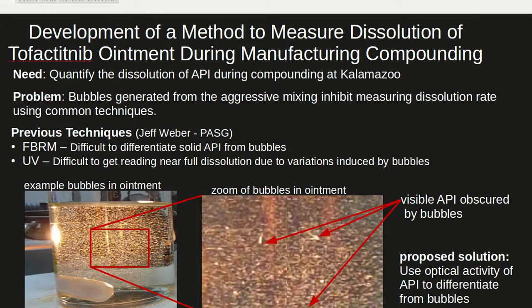This is a brief summary of the development of a method to measure the dissolution of tofacitinib ointment during manufacturing. The goal was to develop a method to measure the dissolution of API particles in the presence of many air bubbles generated during manufacturing.